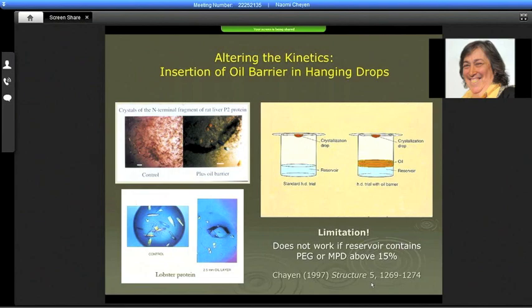in order to slow down the crystallization process. If you take a standard trial, which you see on the left, those two Limbro or whatever crystallization vessels, you take the conditions which give you the small crystals. And then all you do is put a layer of a mixture of paraffin and silicon oil.